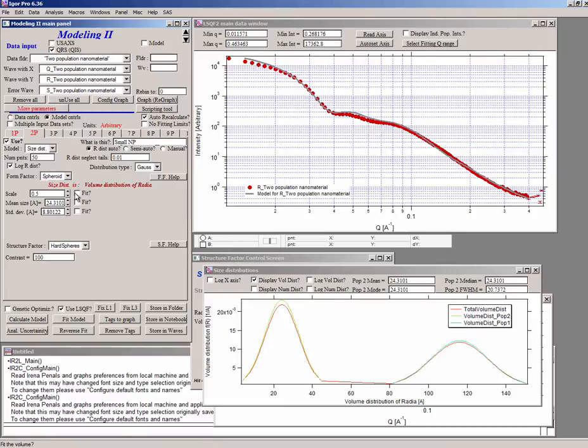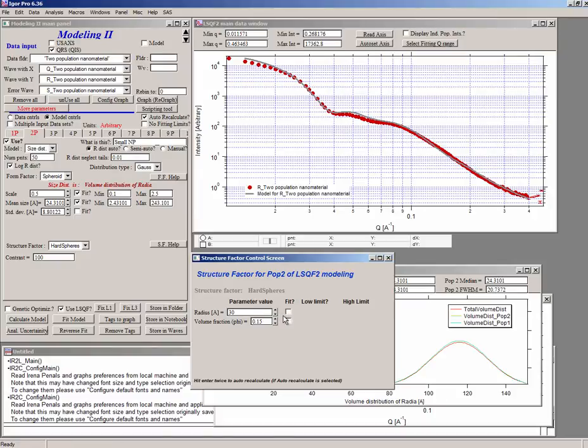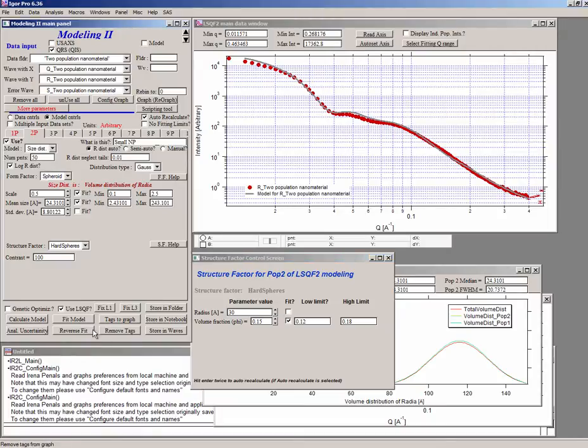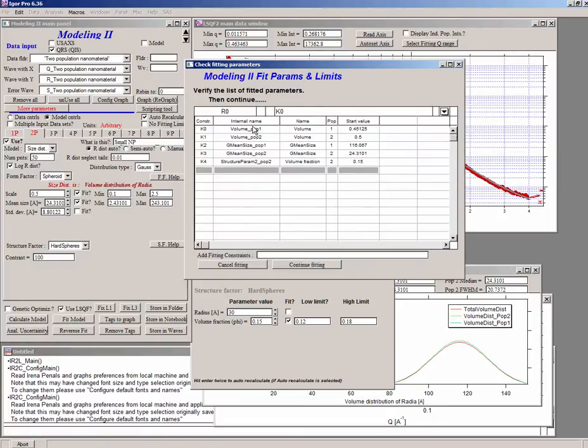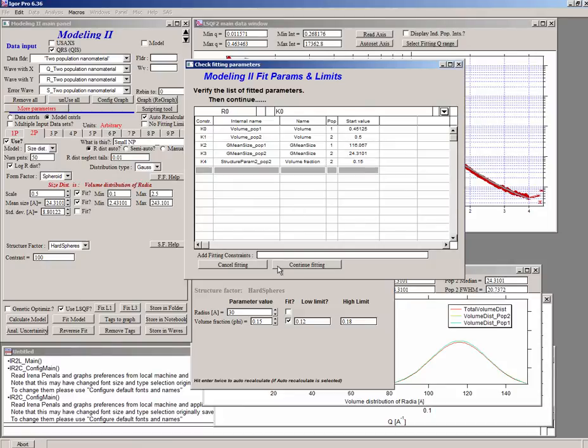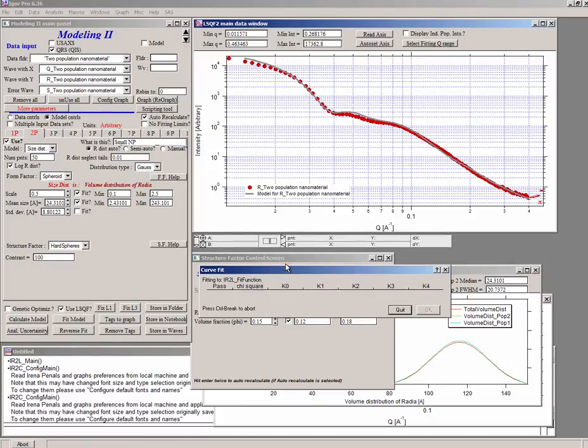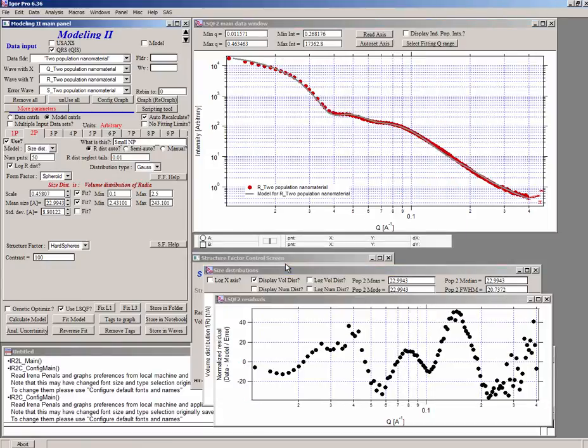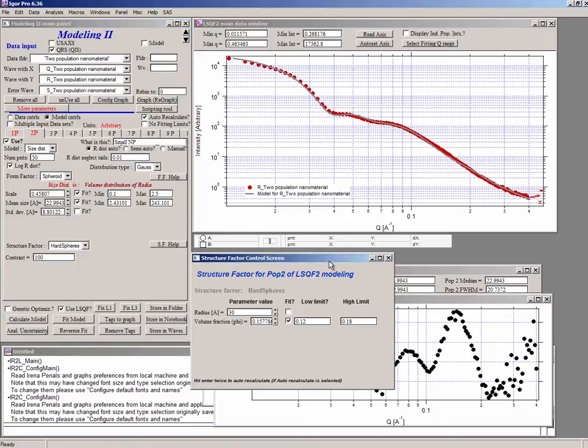And then we can do a fit model here. What it does, it presents us with the list of parameters we are fitting. That's because I have noticed that sometimes people just fit too many parameters. And they actually forgot which parameters they are fitting. So this screen here shows which parameters are going to be fit. So we're going to continue fitting. And we have got some optimization here. The next thing is, if it reached reasonable numbers, we can look at it and say, well, do we like these numbers? Did it go in any way in a non-physical way?